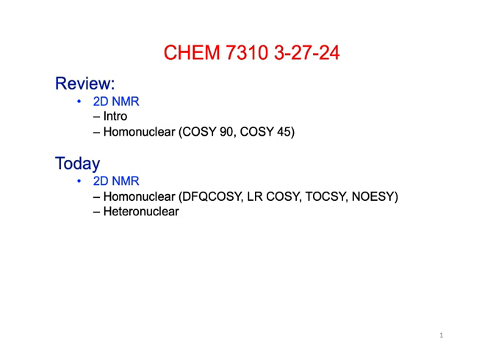All right, so today we're going to continue on with our 2D-NMR. Last time we went through a little bit of an intro, gave just a simple example of what a 2D-NMR pulse sequence might look like. 2 dimensions essentially means that there's 2 different time delays. There's the acquisition and then there's some evolution time.